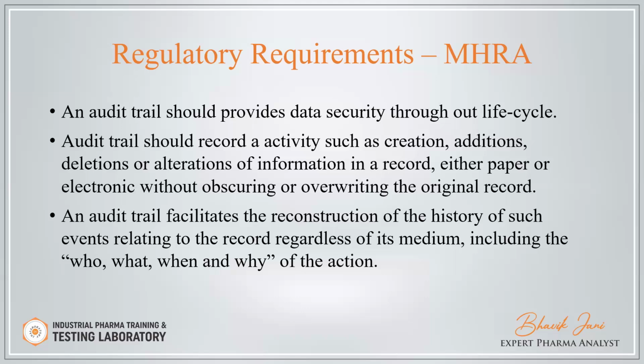An audit trail facilitates the reconstruction of the history of such events related to the record, regardless of its medium, including the who, what, when, and why. Audit trail should capture all the activity, and in the future, if we want to review the audit trail, we can reconstruct all the activity: who generated the data, when the data was generated, what is the purpose of generating the data, and why any changes are there. All the W's should be available in an audit trail.